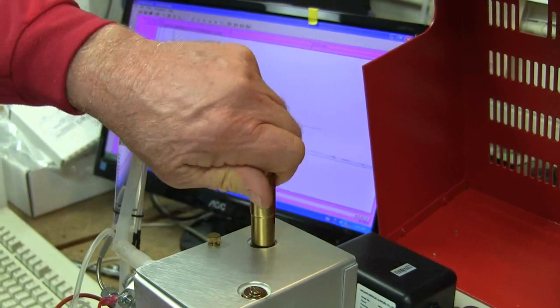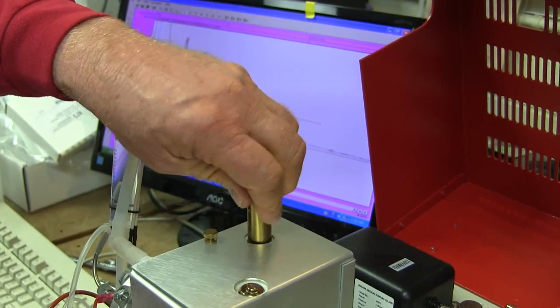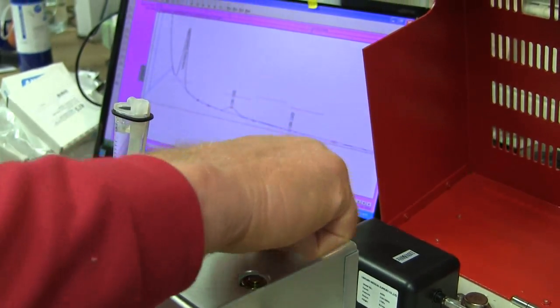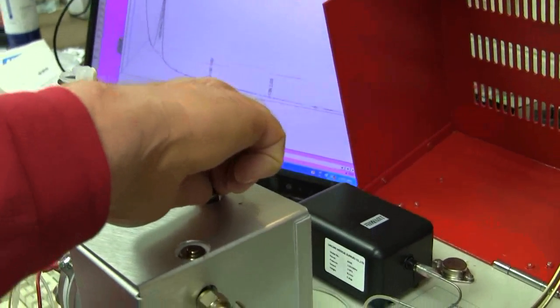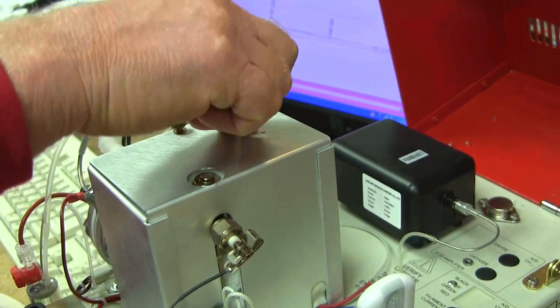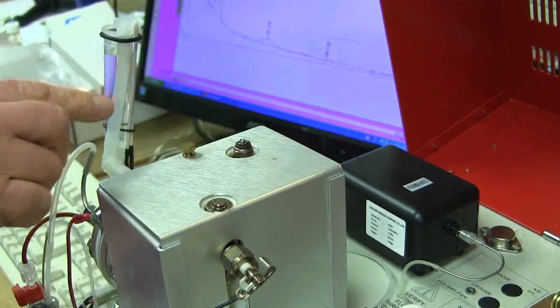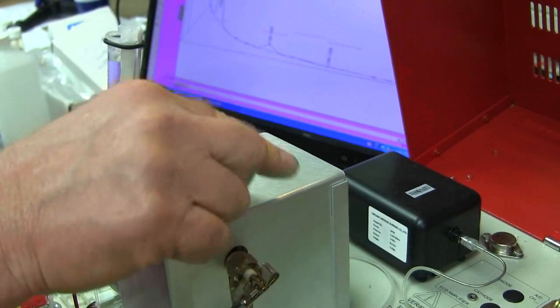So if it's cold, it's easy to feel. So you just catch the threads and then turn it maybe a full turn. You can kind of feel when the septum touches the corresponding fitting that it's sealing against.